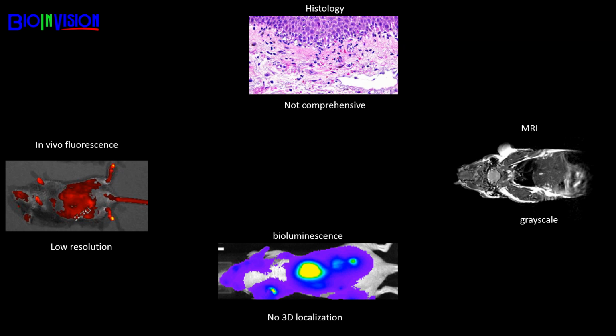Any of these traditional tools may be correct to employ at times, but no single modality has been able to really address the complete wish list of solutions or insights. Trade-offs have to be made, or combinations employed. For example, resolution versus image field size. Compensating for these limitations can mean extra cost, time, and complexity associated with your imaging.